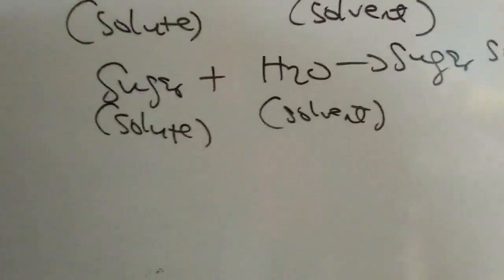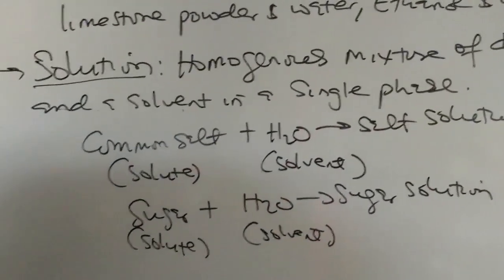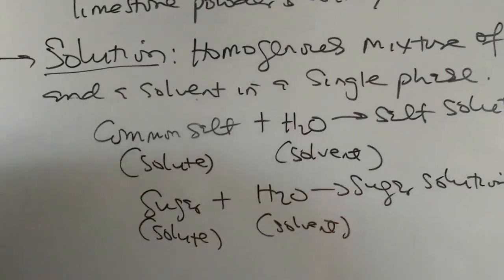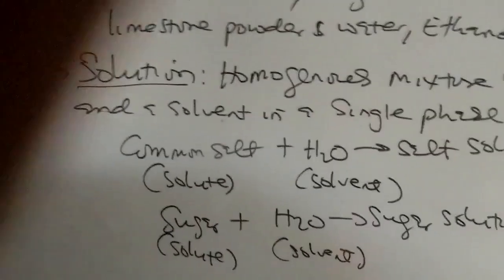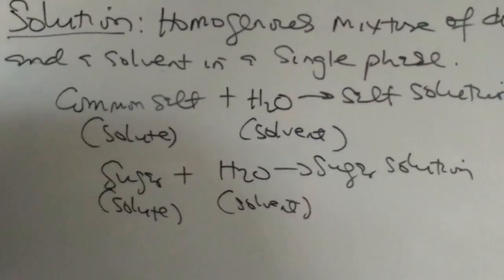Why do we say that solution is homogeneous? We say that it's homogeneous because if a substance is dissolved in the liquid known as a solvent, the particles of the substance will not appear again. They will be totally dissolved. The particles of the substance can be called crystalloids. They dissolve and we don't see them again with our naked eyes.